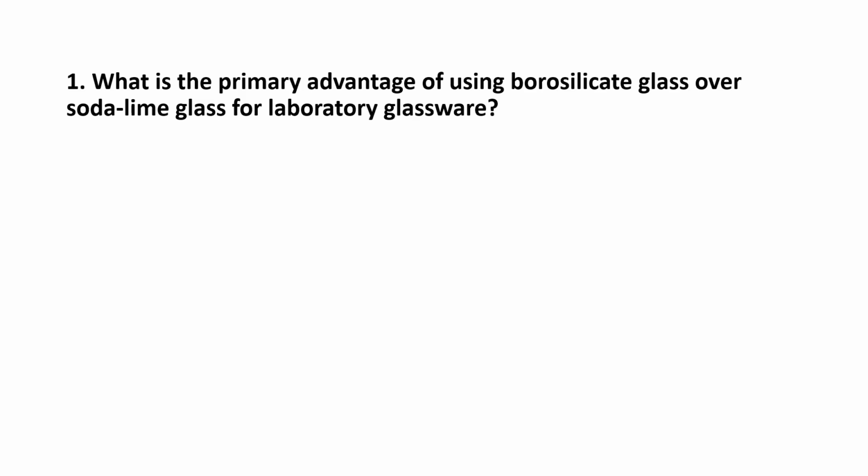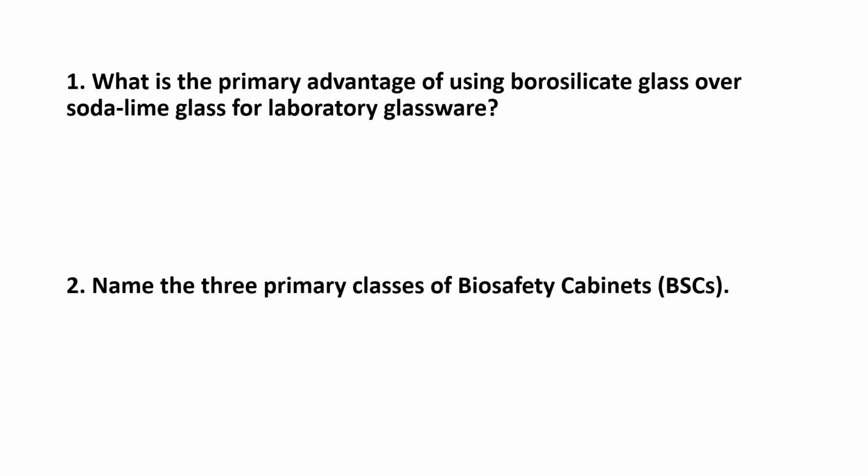So let's start with our first question. What is the primary advantage of using borosilicate glass over soda lime glass for laboratory glassware? Okay, what do you think this answer is on question number 1?